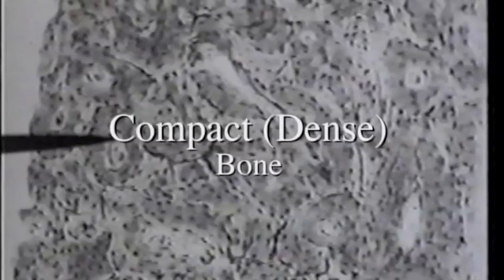This is a view of dense bone or compact bone on low power. It's very distinctive tissue, doesn't look like anything else, and you'll see that as we now move to high power.